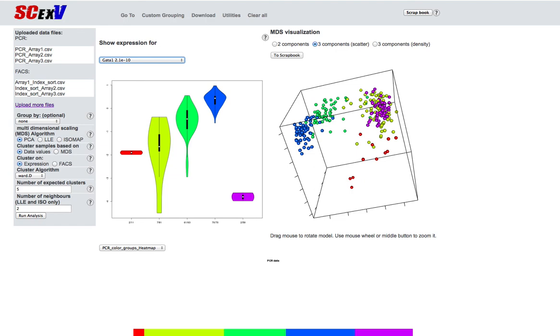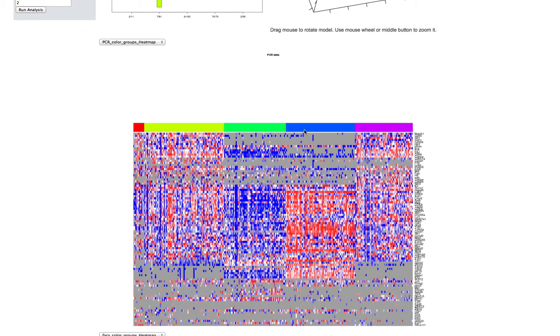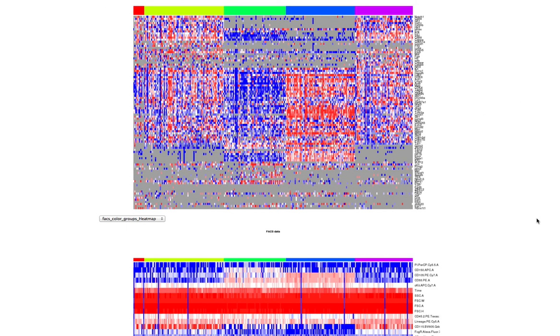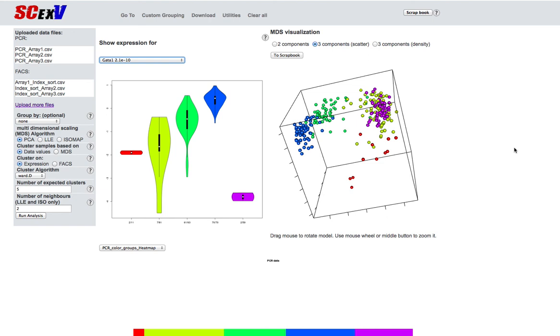If we scroll down a bit further, we can look at the updated heat map. Now they're coloured by cluster, and the same also goes for the surface marker expression as well. Regarding our erythroid cluster here, you can see that the surface markers involved are CD105 and CD55, but exclusive of CD115. So you can see that it's a very quick way of getting an overview of your data, clustering it, and then finding which surface markers are responsible for the separation that you're seeing in your plots.